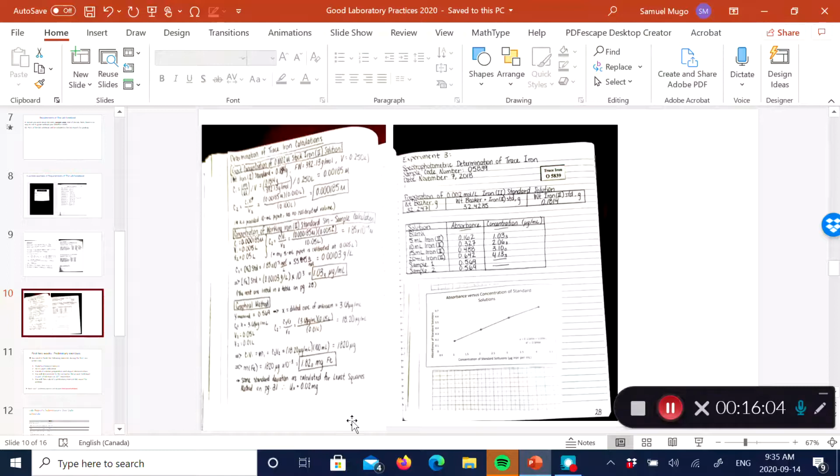Similar to this again, I think this one was spectrophotometric determination of trace iron, which will be your first lab in the 3rd week. Again, you can see the date should be there, and the sample code should be very clearly taped in there or glued in there or written in a very legible way. The data that was initially collected in the lab should be indicated there.